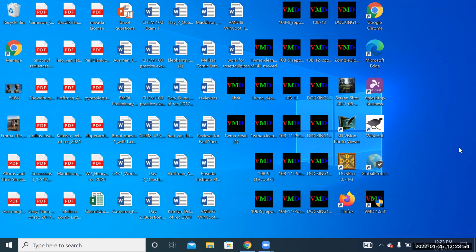And when you do that, you'll see that I've provided you 1WMA clean, no AB3. Now, the reason why, if you remember, if you move your amino acids around, you're going to want to do that first thing. You'll want to create a version of this in WinCoot.